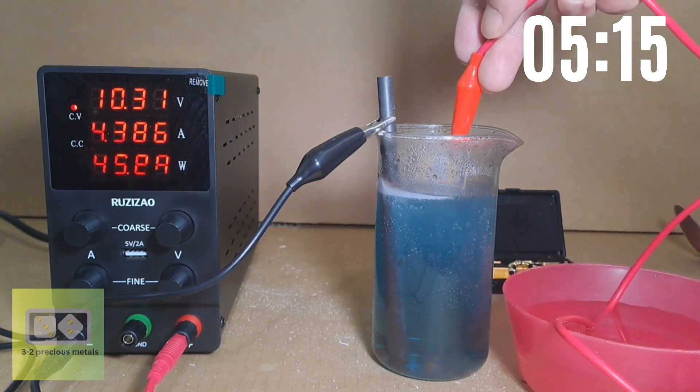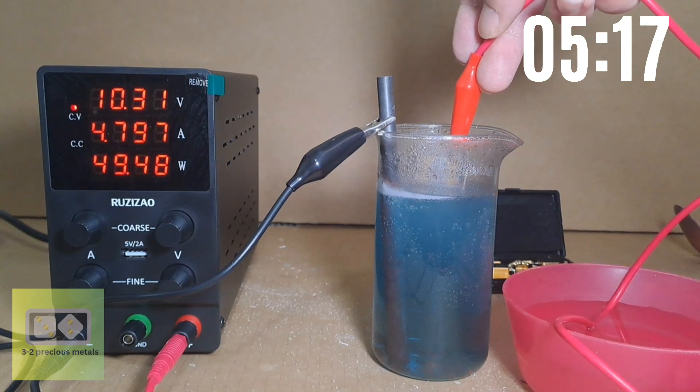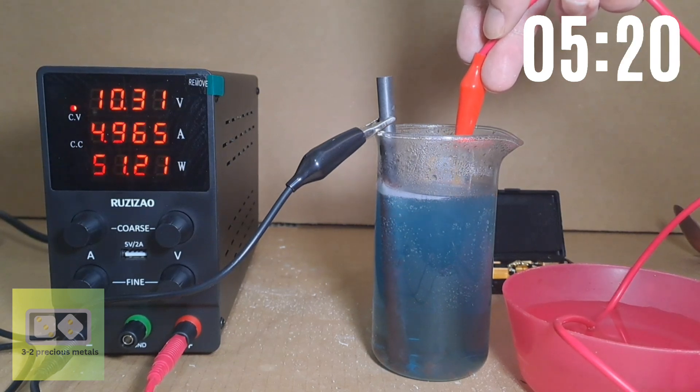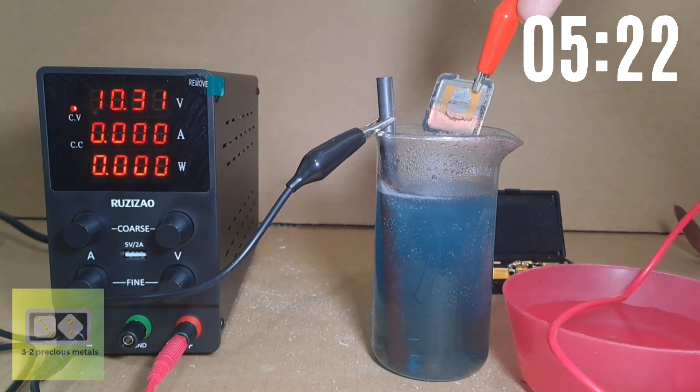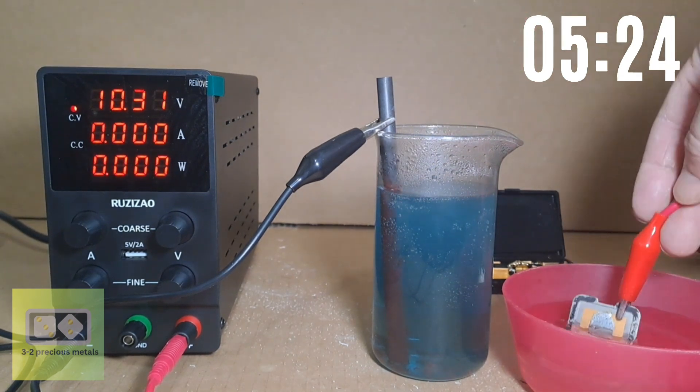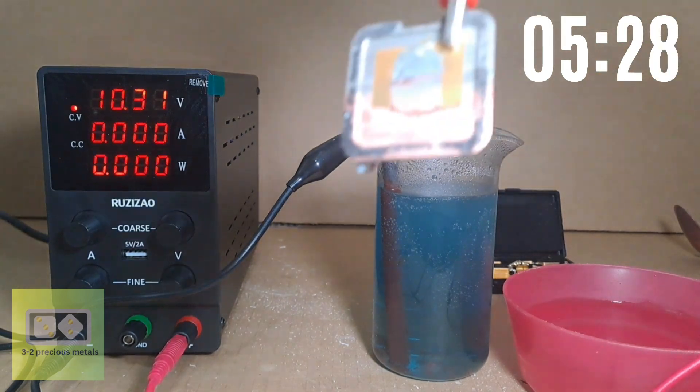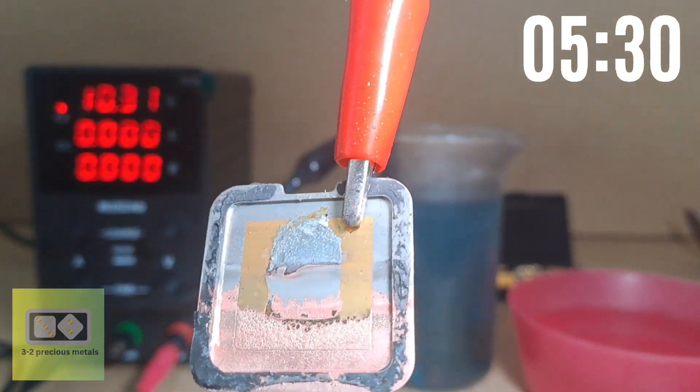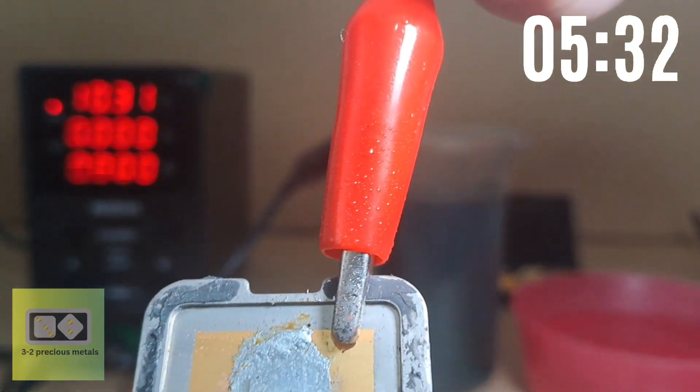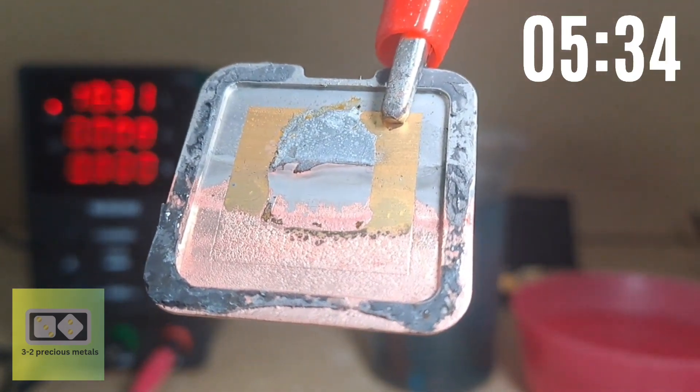Using sulfuric acid, the gold would have been removed long before now, and I would have gotten through a couple of these heat sinks. But we're at five and a half minutes, and we're not even halfway through the first one. I think I'll speed through a little, and you can see how long it actually takes.